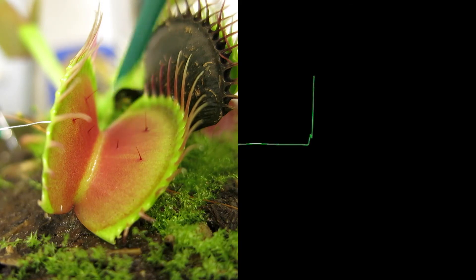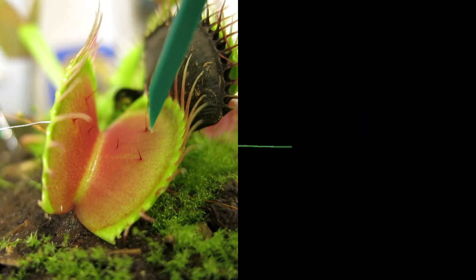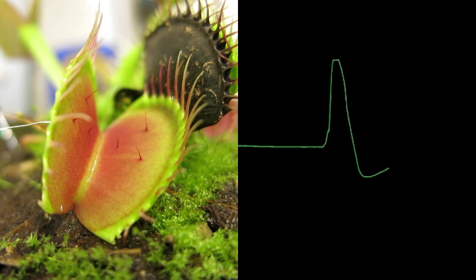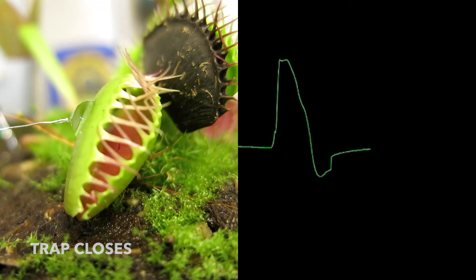Maybe we could do an experiment. You'll notice that when you wait 30 seconds, you get two action potentials, but the plant doesn't close. But what if we only wait 10 seconds between the taps? You get two action potentials, and the trap closes.